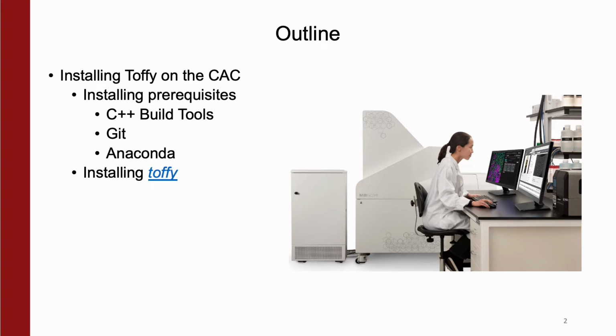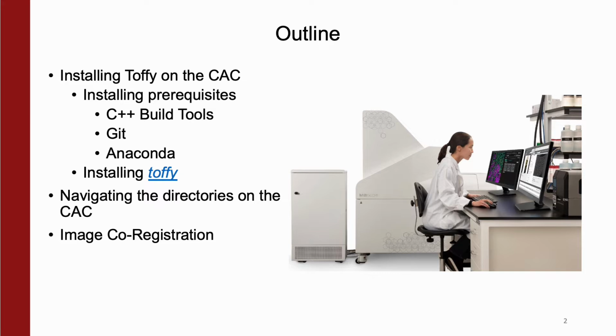Next, we'll install the Toffy library itself. And then using Toffy, we'll be navigating the directories on the CAC that it creates. We'll be performing image co-registration, and then we'll be taking a look at the sensitivity tuning curve.